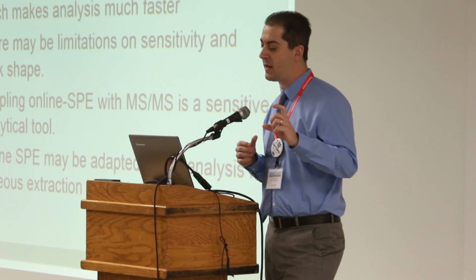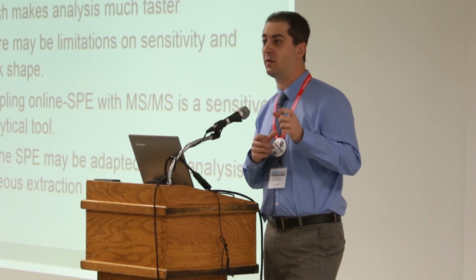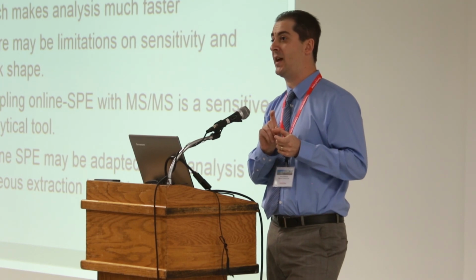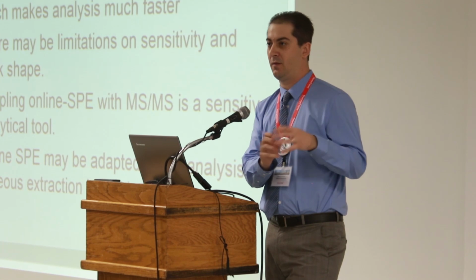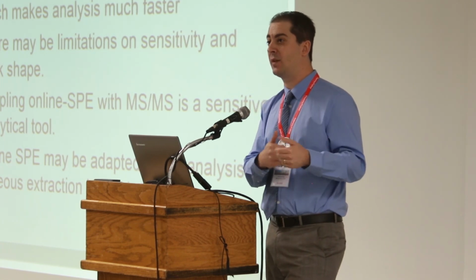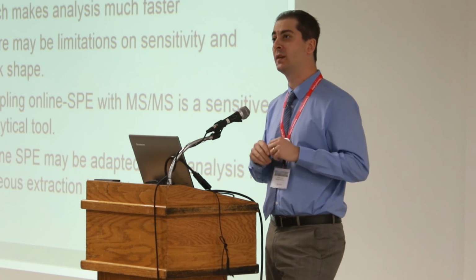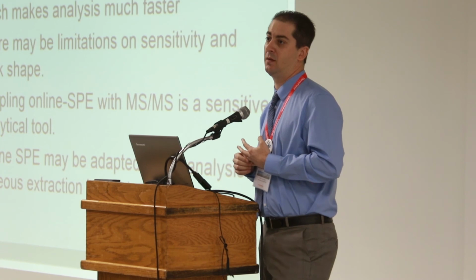One thing I should add, and I didn't mention, is that we stack cartridges. We actually have a Hypersil C18, and on the back end of that is the Strata-X. So the sample actually loads on the C18. We get all the normal trapping on C18, and then those that break through, like iopromide and sucralose, we trap on that polymeric sorbent. But with the WAX, we haven't been doing it long enough to notice any shelf life issues with the online-SPE method.